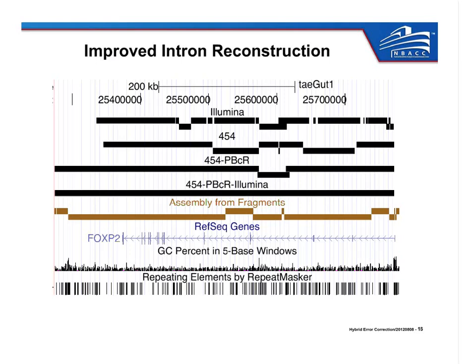If the reads are short, they get discarded by the pipeline, so we don't even bother correcting things that are less than 500 bases, just because there's not a lot of use in correcting things that are shorter than your Illumina or 454 data, for instance. On average, probably about 60 or 70% of the data will get corrected if the pipeline is operating normally. If you see much less than that, take a look at the quality of your PacBio run or contact us. You might have some configuration problems with the pipeline.